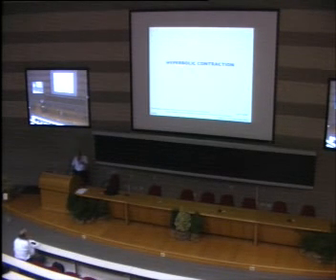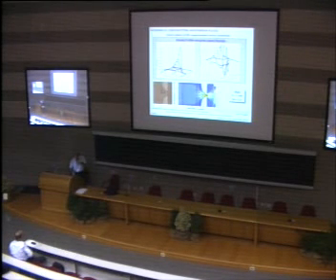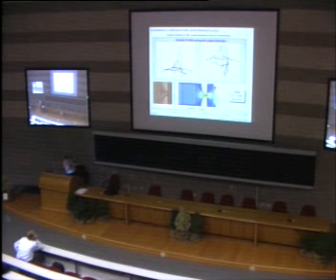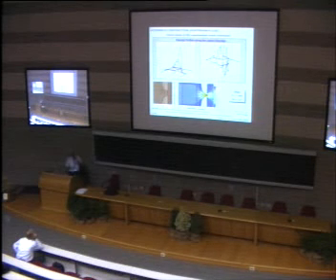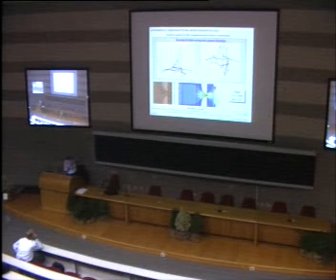The hyperbolic contraction was the first attempt, actually the first work that we did in microfluidics. The idea is to have a hyperbolic contraction here, to have a region of constant strain rate. Then we could measure the pressure drop, and that would be a measure of the extensional viscosity. We found that this did not work very well. We are still doing work with it, but for other purposes.